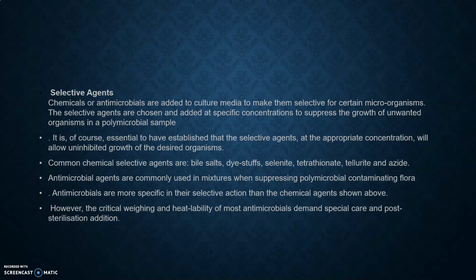So, the selective agents prevent the growth of the undesired organisms. Only desired organisms will grow. Common chemical selective agents are bile salts, dyestuffs, selenite, tetrathionate, tellurite, azide, etc.